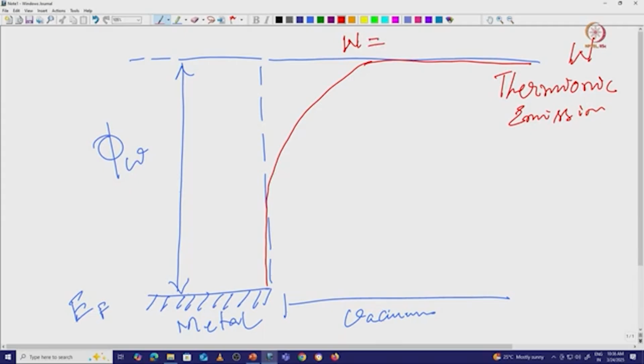You can tell that almost 2500 to 3000 Kelvin of heat energy is required to overcome the work function of the tungsten filament and extract the electron from the metal ion. One more thing: the melting point of the tungsten filament, TM, is 3650 Kelvin.